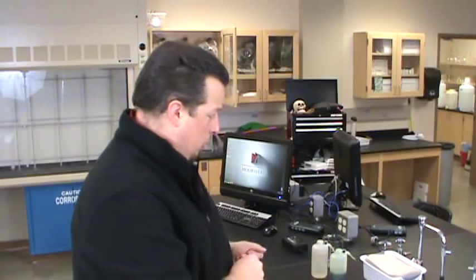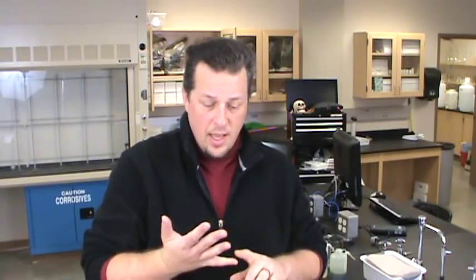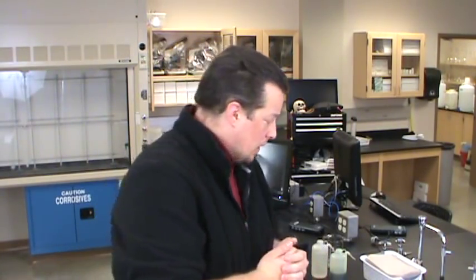So we've looked at some of the things that are going to affect our readings. Path length is something that we're not necessarily going to directly explore in lab, but it's something that's very important to consider. Make sure you read over the lab procedure. Make sure you take the pre-lab quiz in time. And we'll see you all in lab this week to start looking at color.